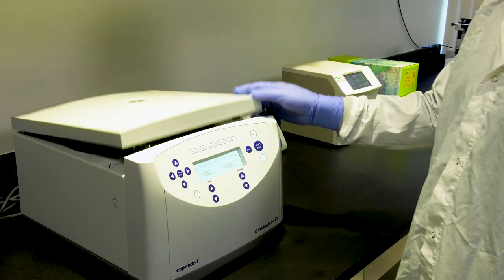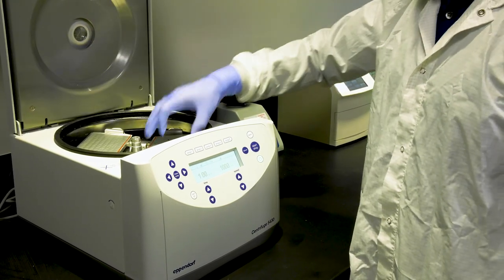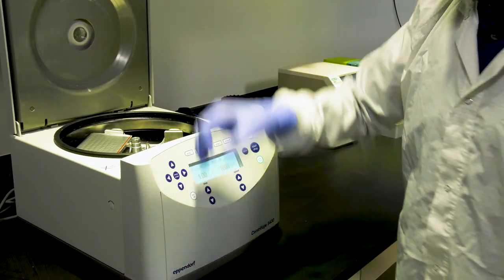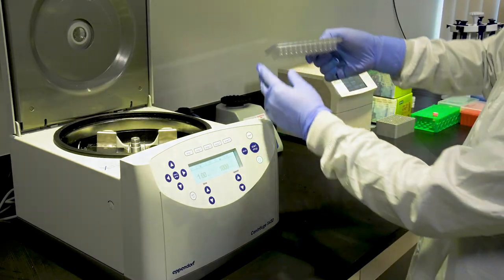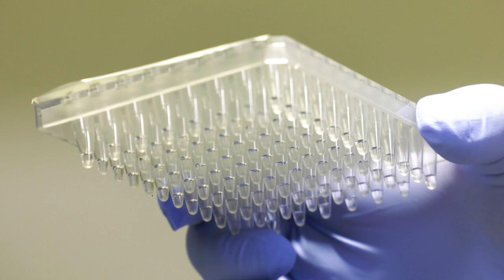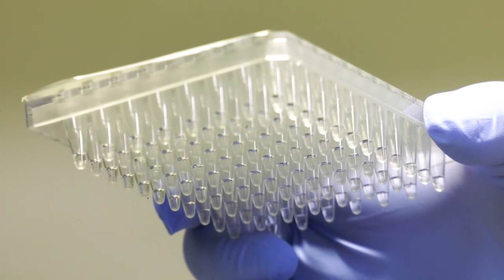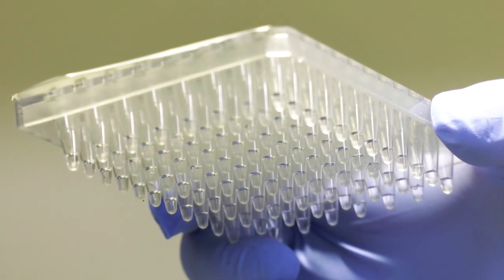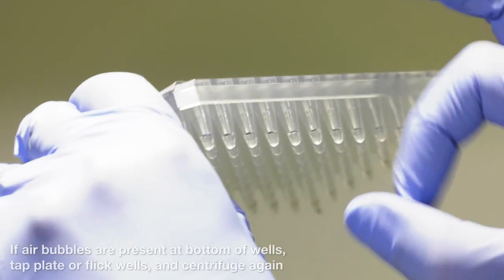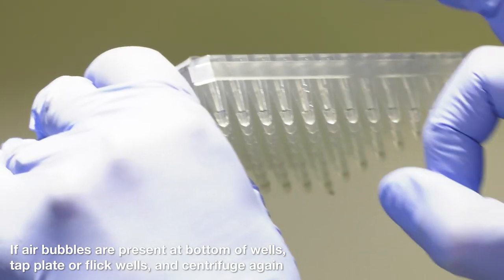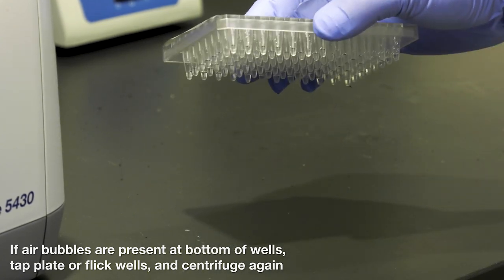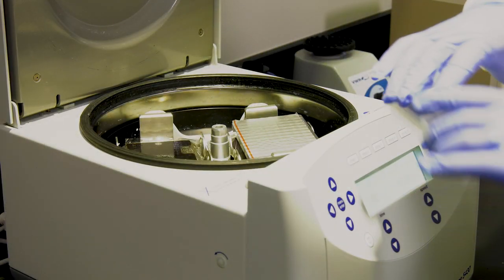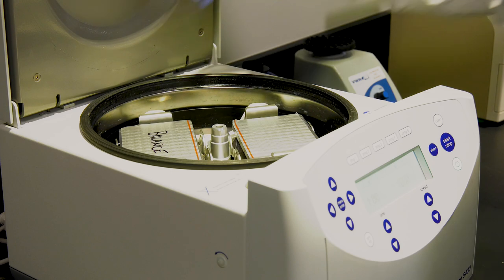Remove the plate from the centrifuge and carefully inspect each well to make sure there are no air bubbles and that all the material is down at the bottom of the wells. If air bubbles are present, you can either flick the well or tap the plate on a hard surface to release the bubbles. Once all bubbles have been released, centrifuge the plate again for one minute.